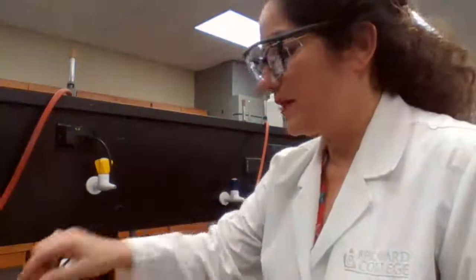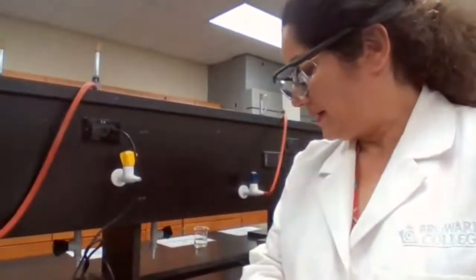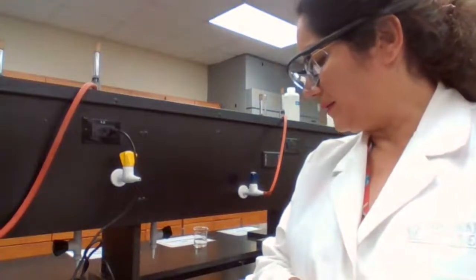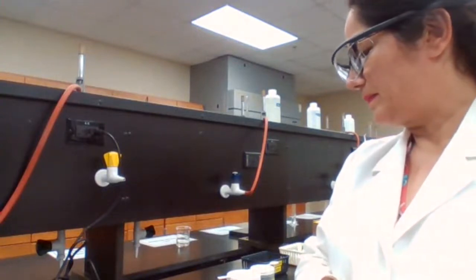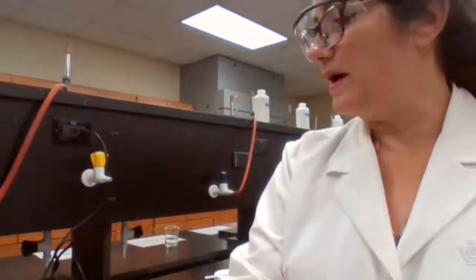Then we take the beaker out. The next item to be measured is the mass of a nickel. The same way, it has to be 0 first, then we place the nickel and record the mass. It's 4.9. The number keeps changing because the balance is sensitive, even to the movement of my hand or my talking here. So I have to make sure it's stable before I record the number. Okay, 4.955, and that is the mass of the nickel.